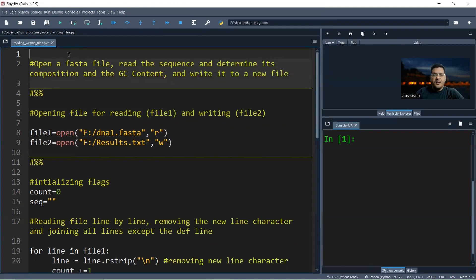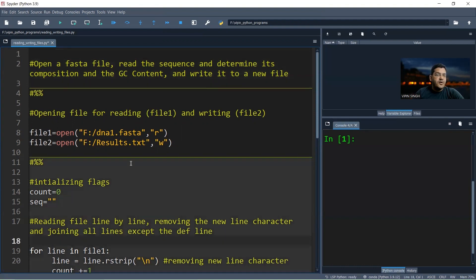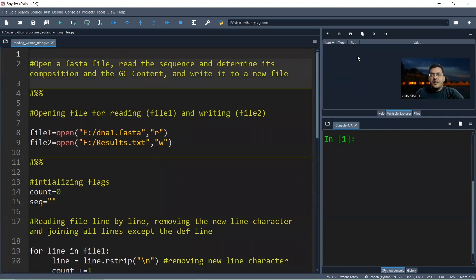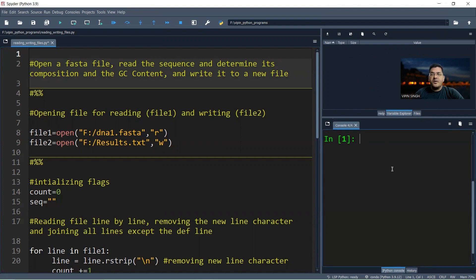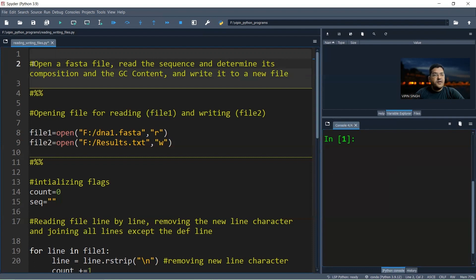In Spyder there are three panels. The first panel is where you write or load your script. The second panel contains the variable explorer, where you can see declared variables, plus a help section and a file section. The console area is your default output area — anything you print through the program will be shown there. In our case we are also going to print to the console and write to a file.